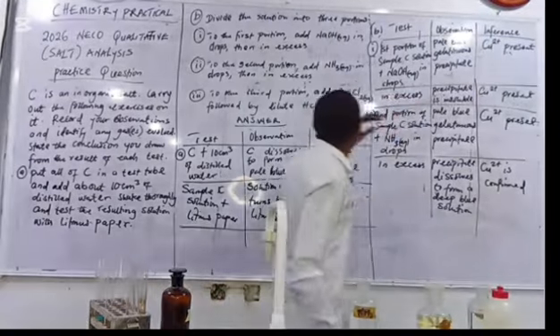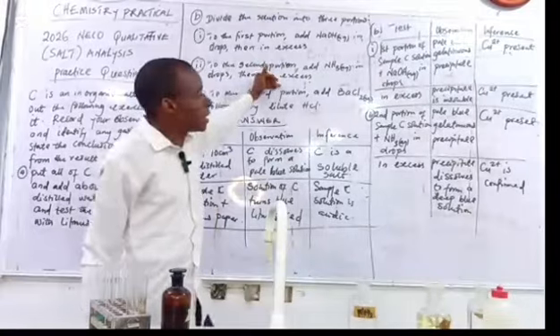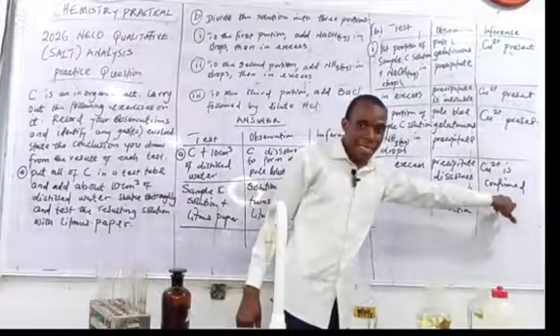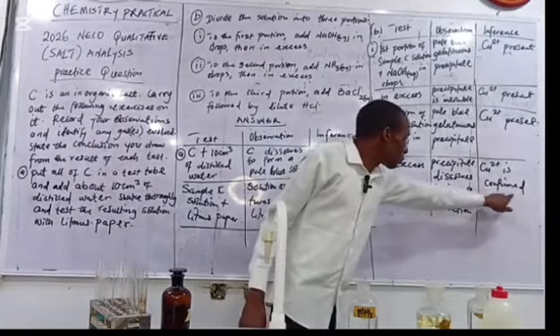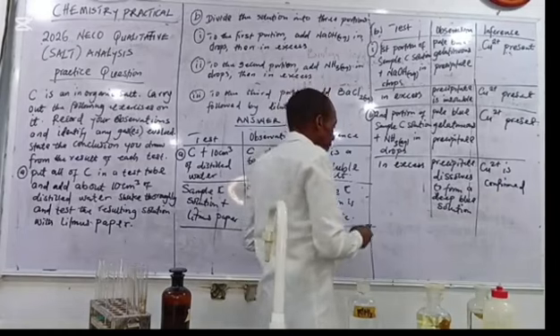Now if this is going to confuse you, you just write present for all of them. It's still okay, and you'll be marked correct. However, if you are asked to add sodium hydroxide then aqueous ammonia, then you can confirm it at the second unit, and you can say Cu2+ is confirmed.